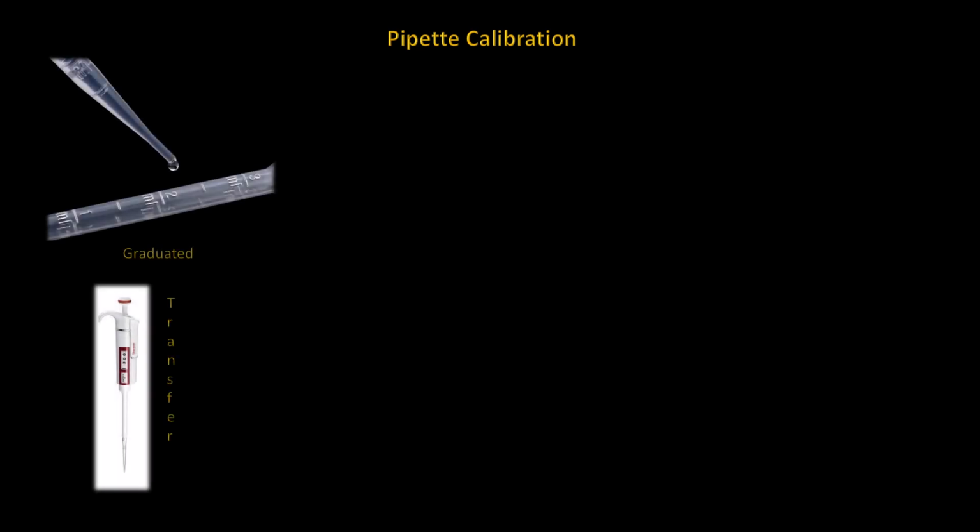There are mainly 2 types of pipettes, transfer and graduated. Transfer pipettes are either preset or have variable presets that are selective. Unlike beakers and containers, such as volumetric flasks, pipettes do have some variables associated with them, such as drain time and drainage angles. Beading on the inner surface, depending on the type of pipette, may be visual, or it may not, such as the transfer pipette shown.